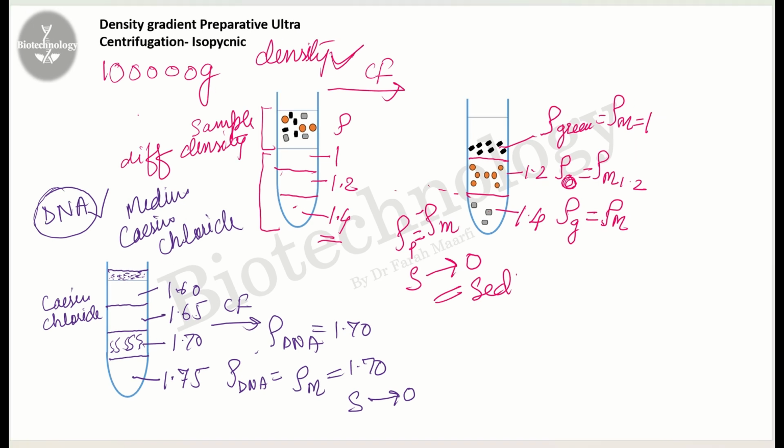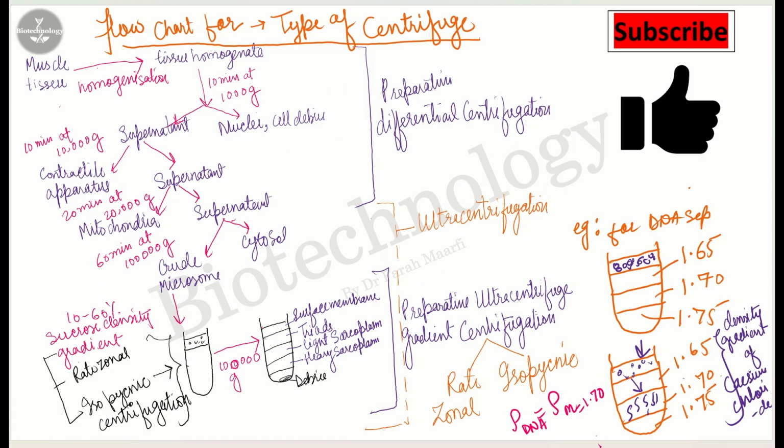So this was all about today's lecture. This is the flow chart for the types of centrifuge from the starting differential centrifugation to the isopycnic centrifugation.